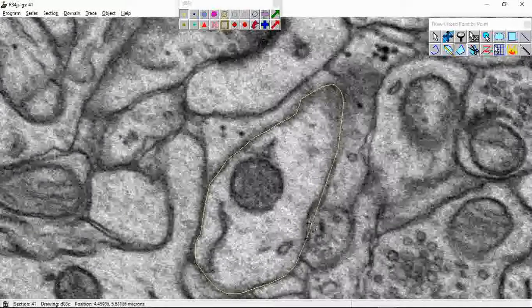However, if you find that you make a mistake with the freehand drawing, what you can do is go ahead and use this clip, backspace, and retrace tool, so the scissors. And when you click on the trace, it will allow you to use the backspace function, and it goes in a counterclockwise manner. So if I backspace again, it goes to each point where I clicked in a counterclockwise fashion. So I'm just going to go trace that back up.